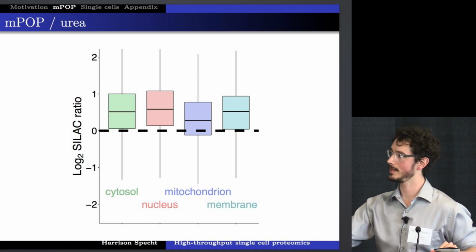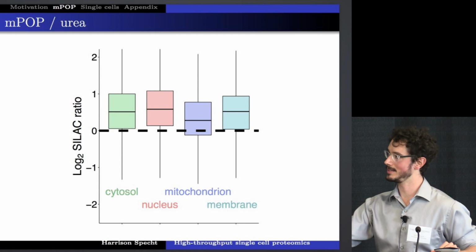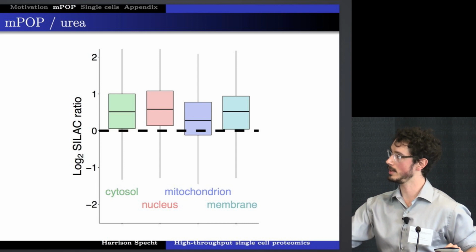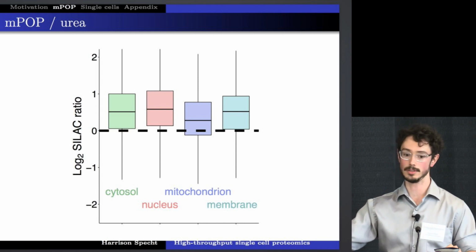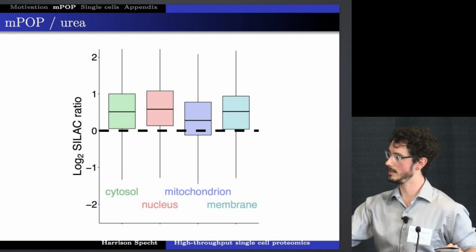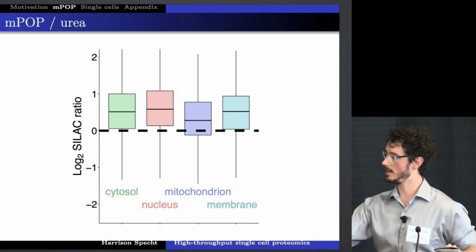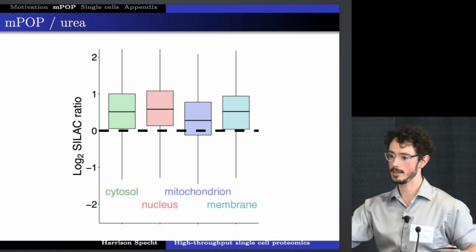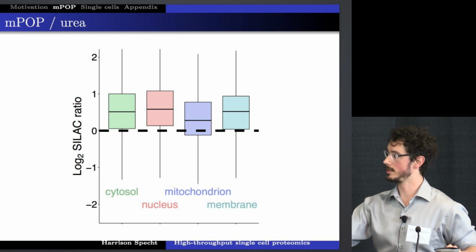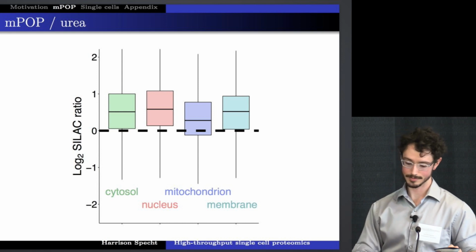I'm not sure this is... gene mapping to proteins to gene ontologies is definitely not the most accurate thing you can do, but this is one way that we started to suss out the performance across the different cellular compartments. We can also essentially feed the data into gene set enrichment type analysis, and when we did that, we found that no compartments in particular were differential, essentially, and passed an FDR threshold.